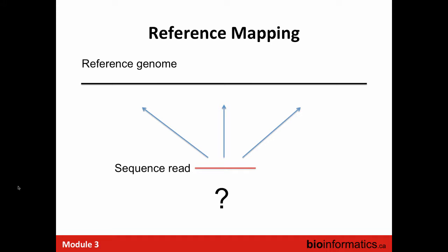Okay, so now I'm going to talk about some of the terminology with mapping reads to a reference genome, mainly mapping quality. So we can visualize the process of mapping a read to a reference genome like this.